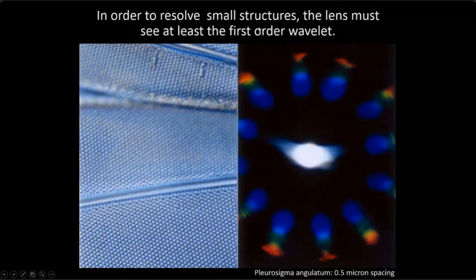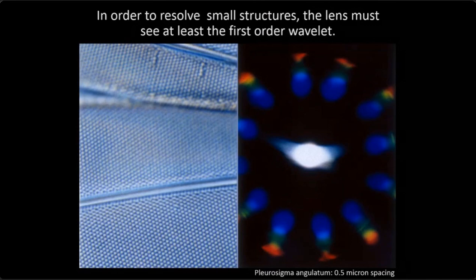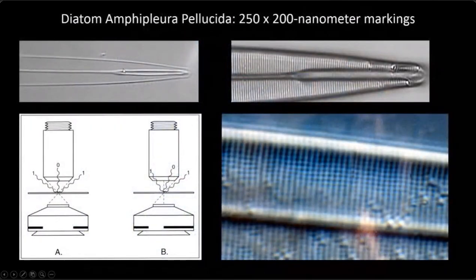Let's look at something right on the limit of resolution of a light microscope. This is Pleurosigma angulatum — these little spacings are half-micron spaces, pretty close to the resolution limit. If you take the eyepiece out and look down the back of the objective, that's the zero order and this is the first order. We're not seeing the second or third order because as object spacing gets smaller, the diffraction wavelets separate farther apart, until at some point the objective lens can no longer capture them.